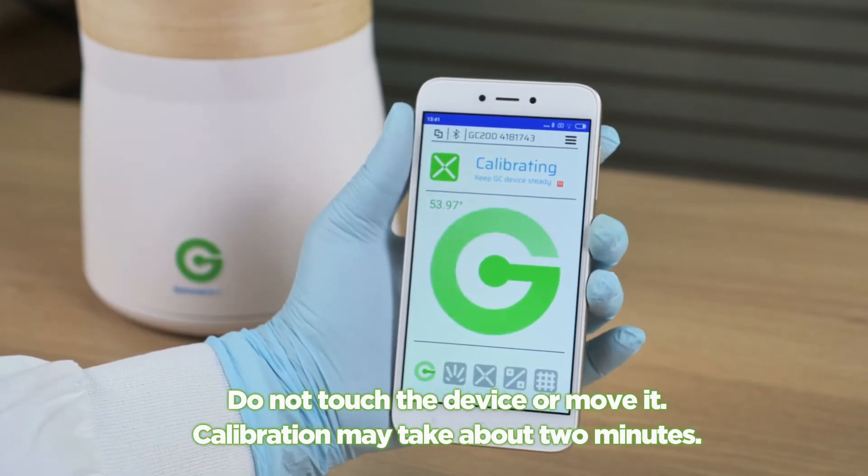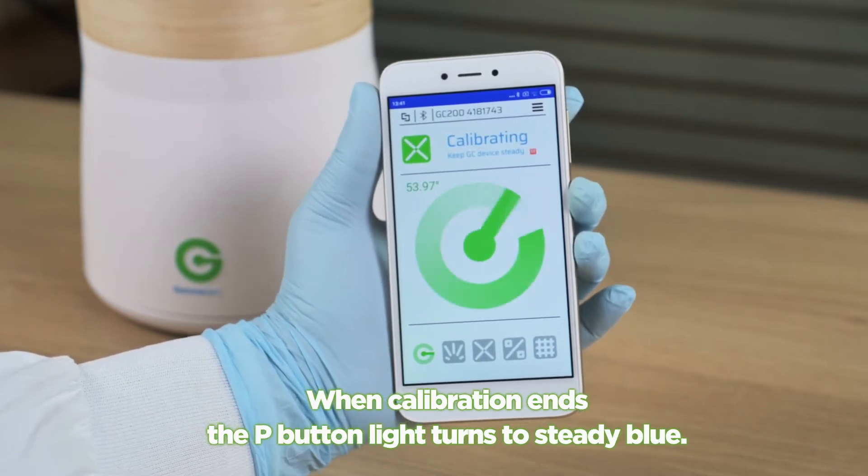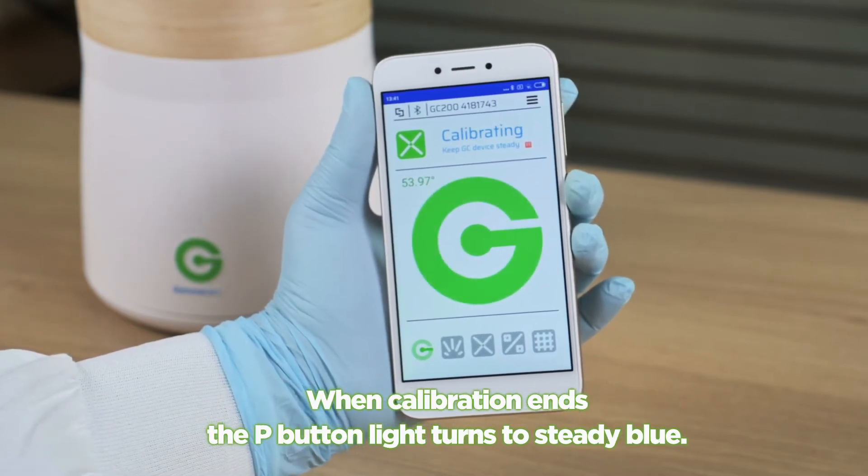Pull the sample container out and then press OK on the app. Do not touch the device or move it. Calibration may take about two minutes. When calibration ends, the P button light turns to steady blue.